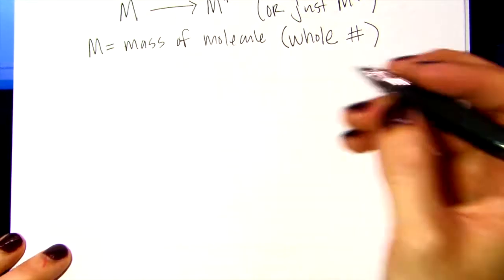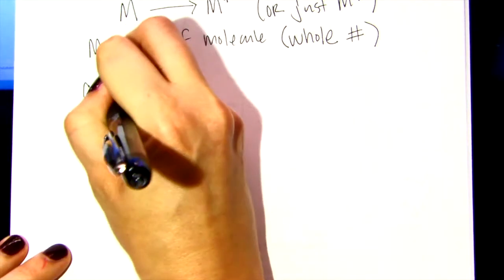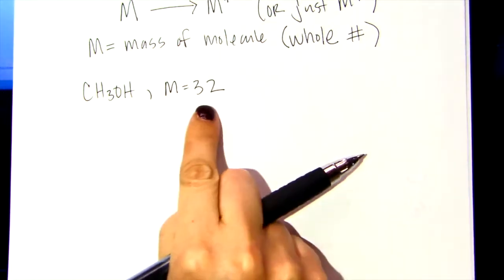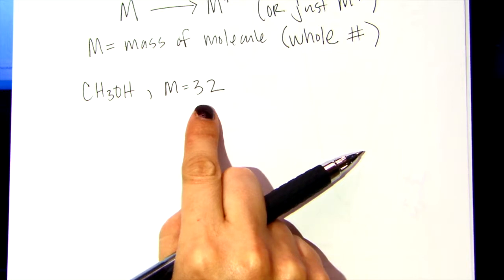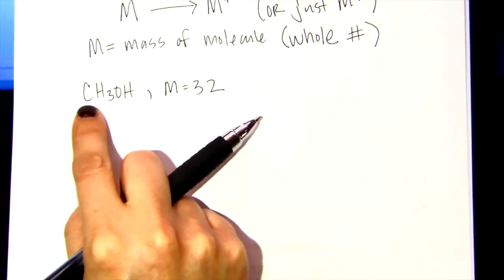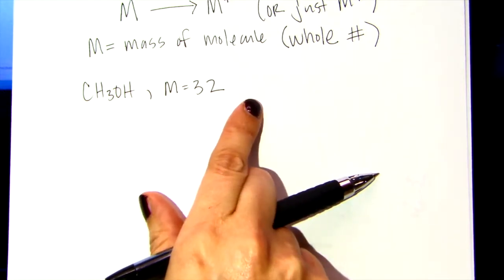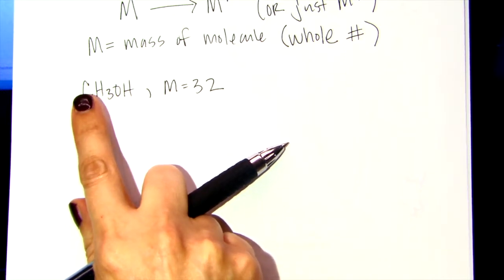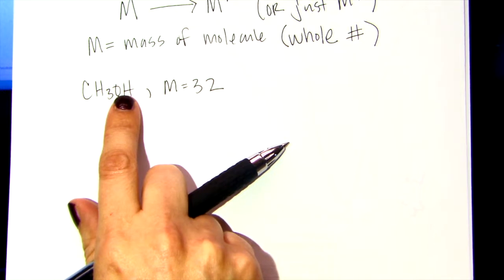And so, again, our methanol has a mass of 32. And this is different than if I said calculate the molecular weight, right? Normally you'd go to your periodic table, look up the molecular weights of these and add them up, and you get some sort of decimal number, right? But here we're talking about a single molecule at a time. And so it's most likely to have the mass that's made up of the most common isotopes that you would find, right? The molecular mass on the periodic table is an average of all the naturally occurring isotopes, right? So it's not a single isotope.